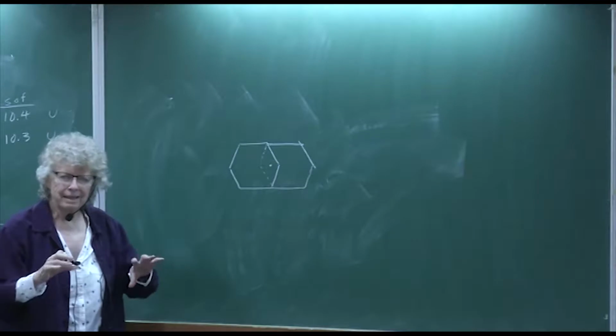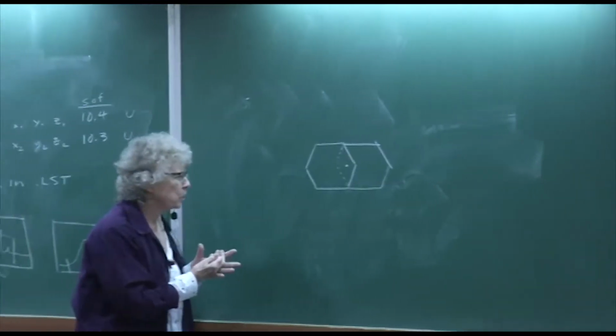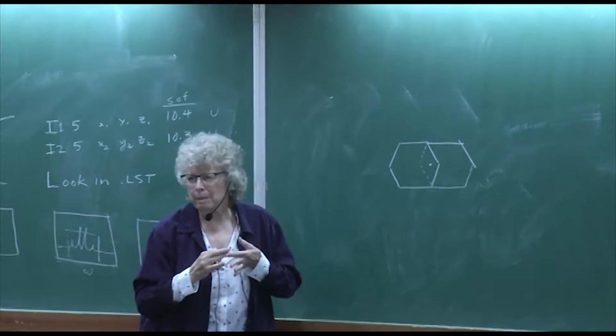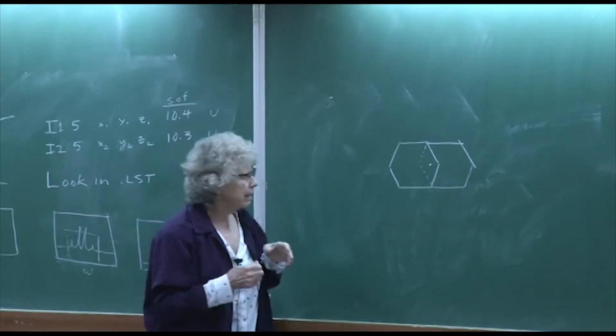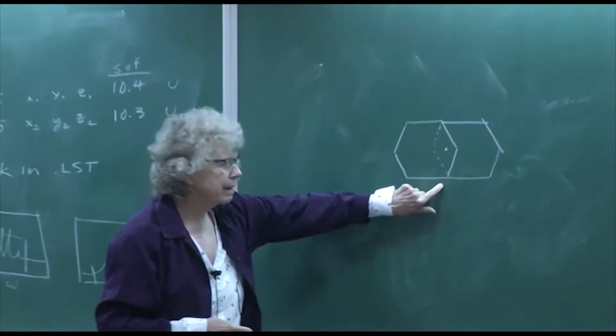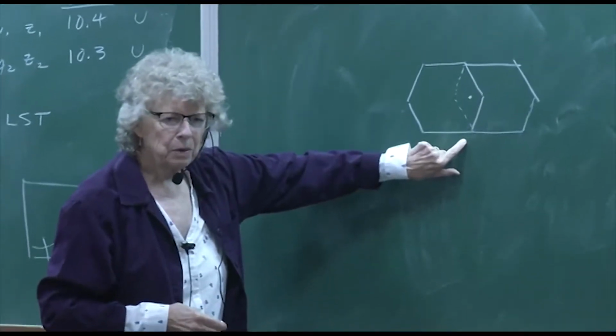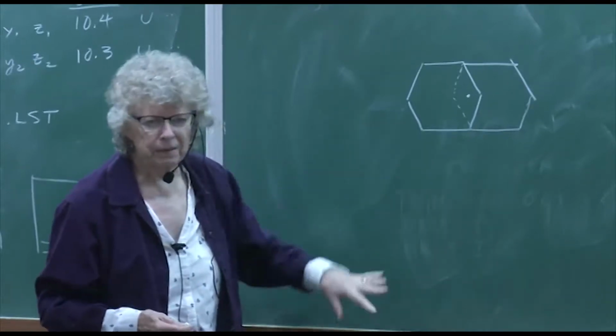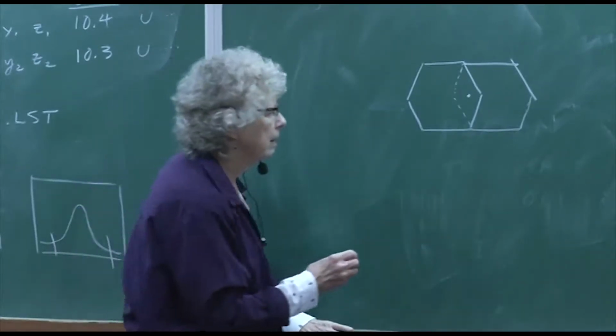But the point is that it isn't just sitting on one side. It's being disordered with respect to the symmetry position. And so this tells you right away that you've got disorder with respect to symmetry. I'm leaving off the hydrogens and everything. Just don't worry about those right now.